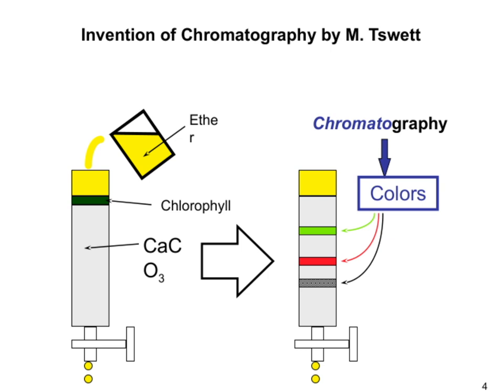Ether, on the other hand, is an organic solvent frequently used as a mobile phase in chromatography because of its ability to dissolve various compounds.